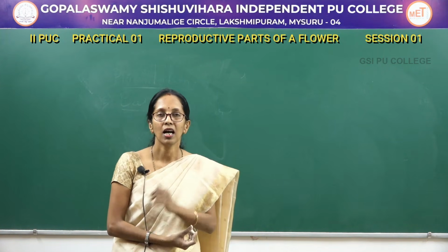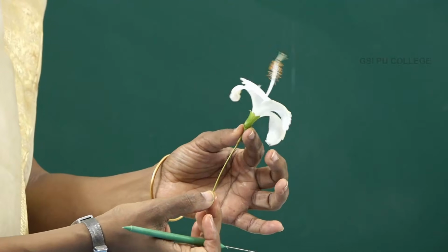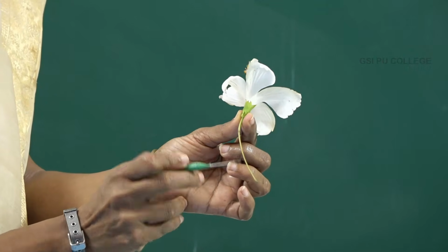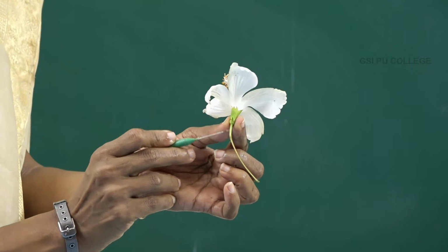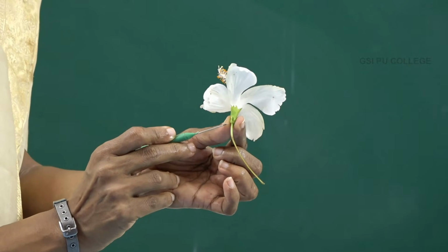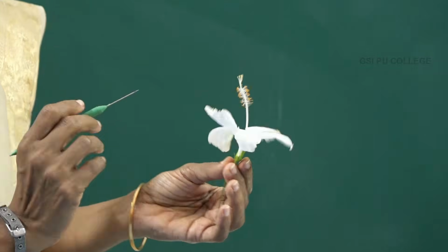So, this is about the Androecium and Gynoecium. This is a hibiscus flower. You can see from here to here, this part is the main axis and this is the peduncle, and a very small part is the pedicel, and the tip of the pedicel is the thalamus. On the thalamus there are other floral parts.